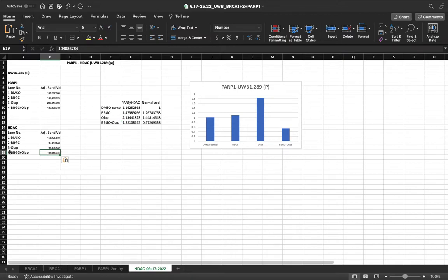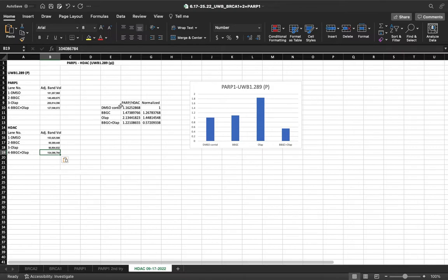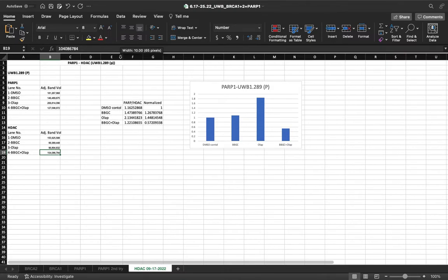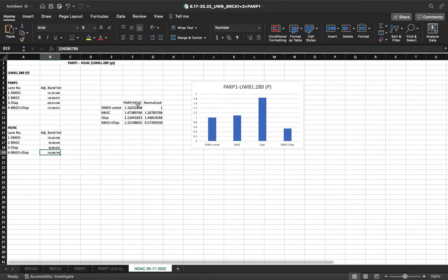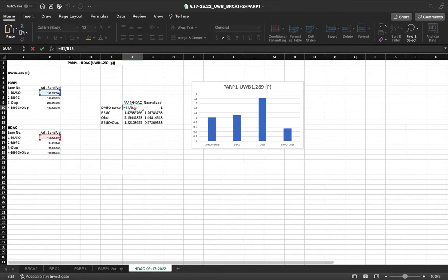As you can see, the fourth one was a BBGC and an Olaparib treatment. Now, you can see my values automatically popped up. This is because I've set a formula.